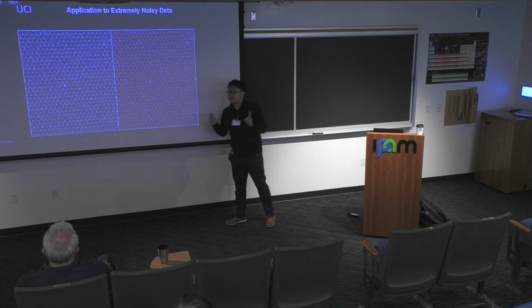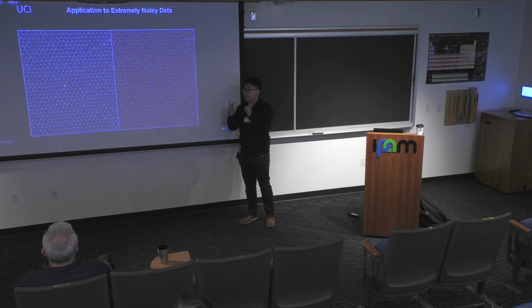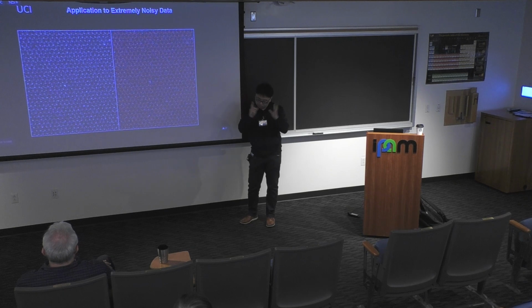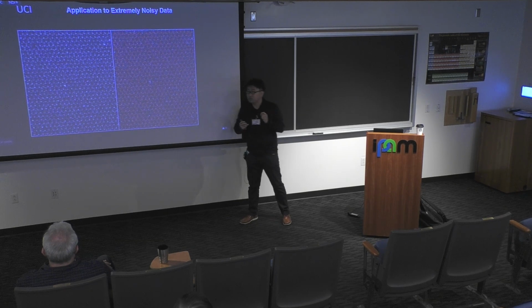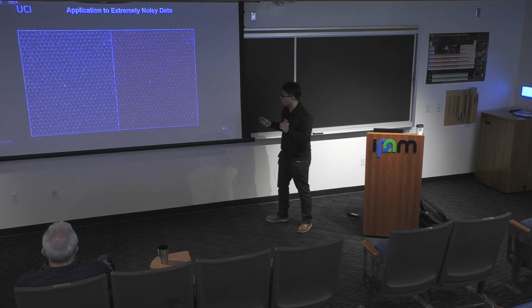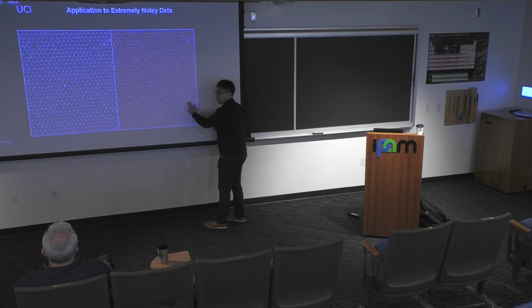Again, in creating this model, my initial intention was not to give you a very exact location of atomic coordinates as Paul's group did previously. What I wanted to do is just tell you where they are so you can do further analysis on it.